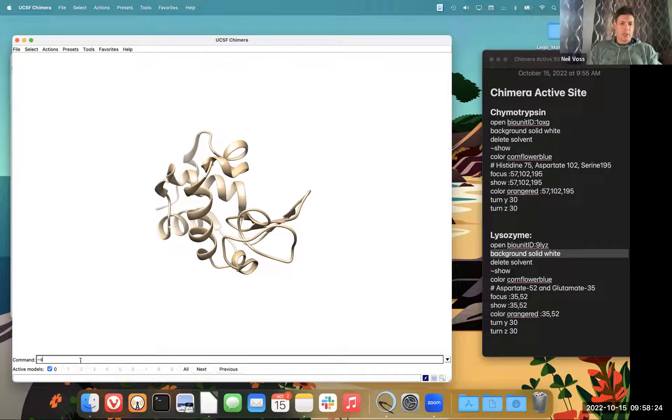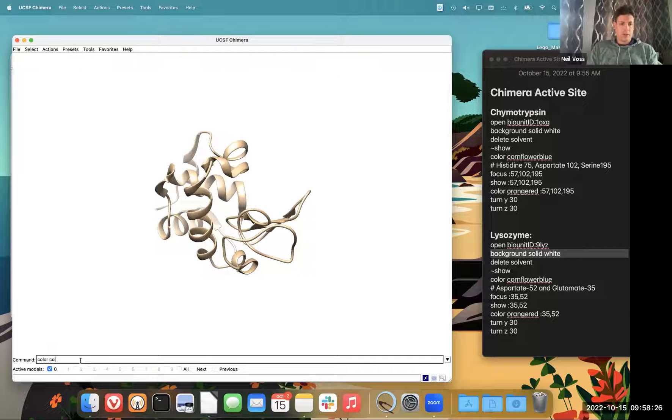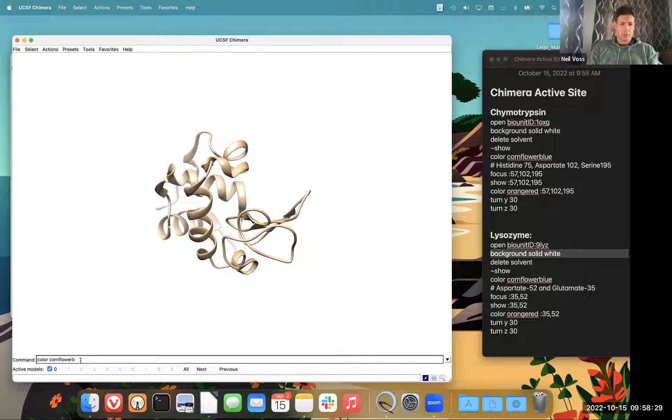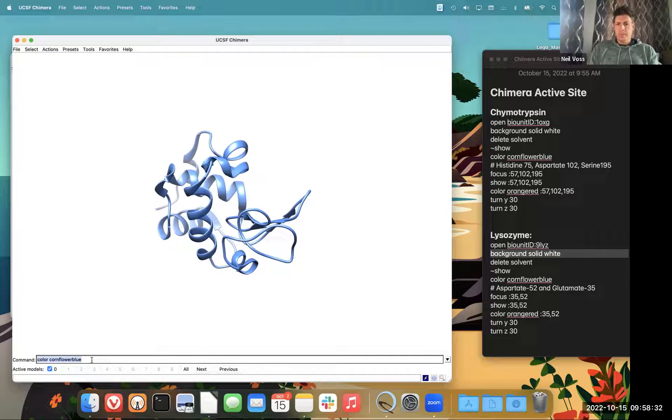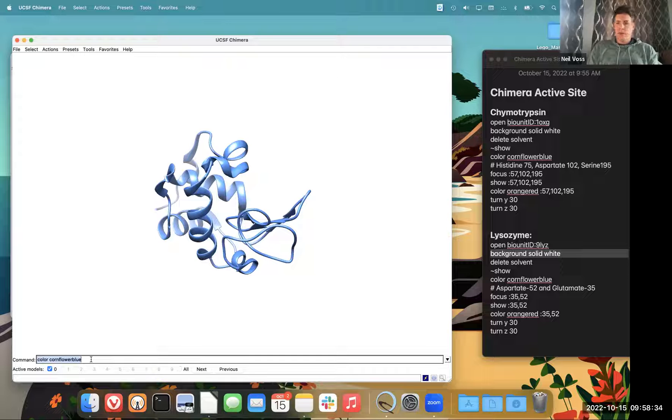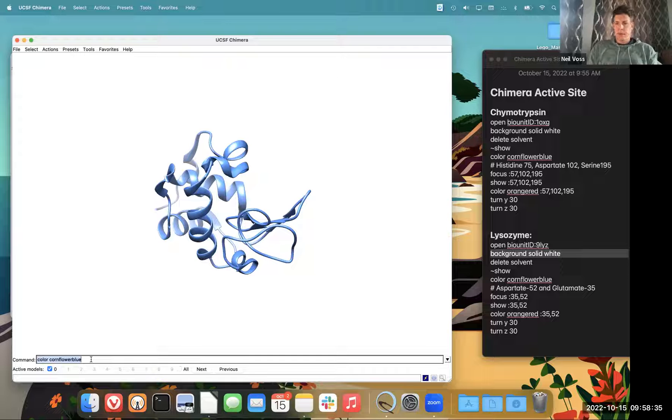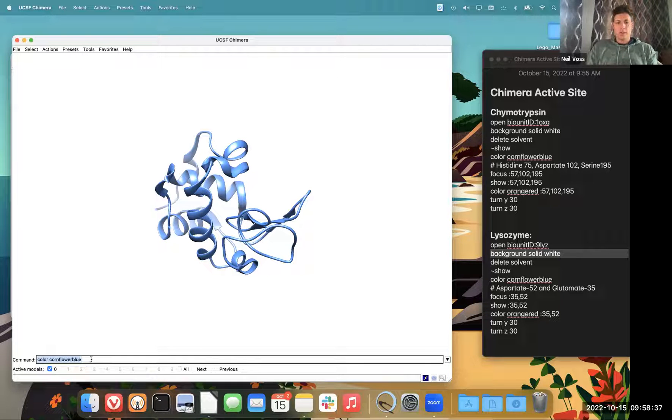I wanted my students to color the protein blue, can be any version of blue. So I'm going to do cornflower blue. I'm interested in amino acids aspartate 52 and glutamate 35.